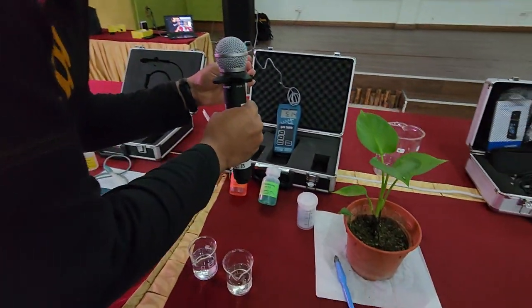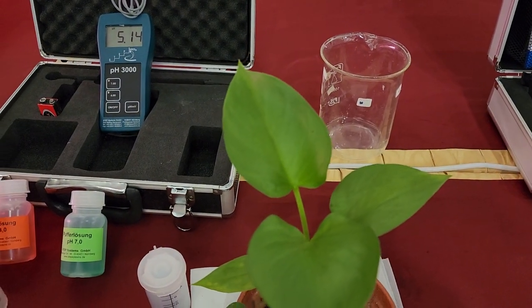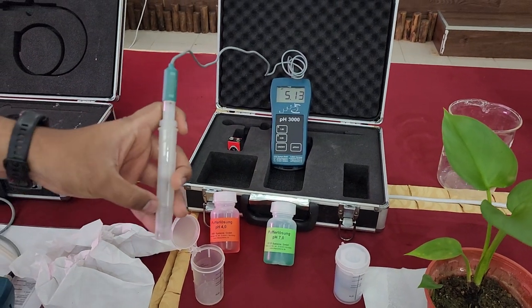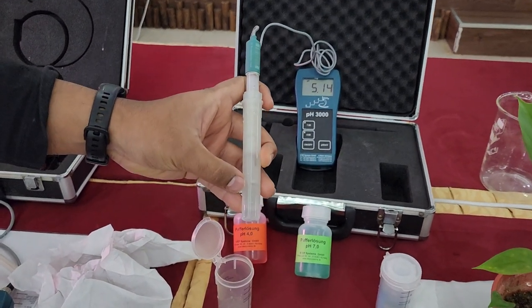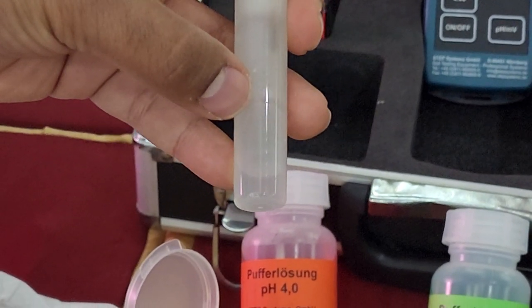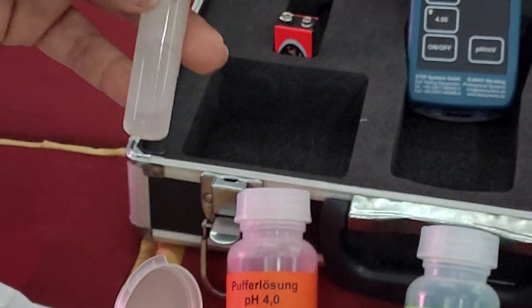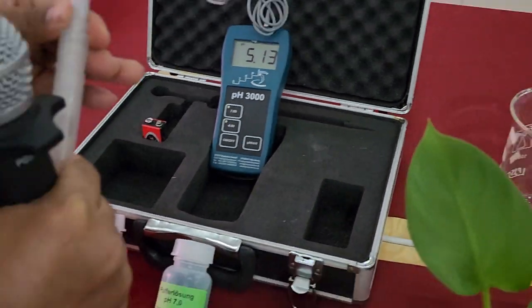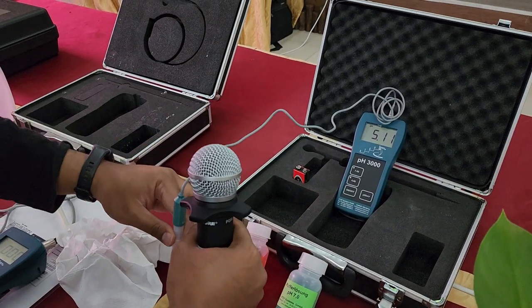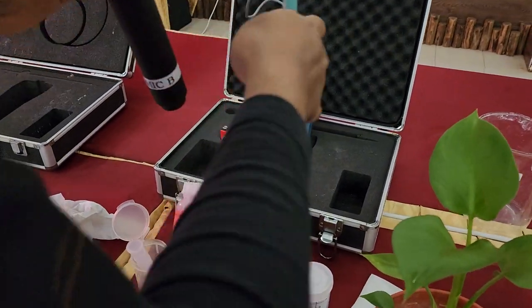Let's open this. I need to be very careful with this. You need a container before we spill the... So this probe is actually in a solution, if you can look closer. Potassium chloride solution. Never store the probe in distilled water. You need... because it's a sensitive piece of equipment. Okay, open that. Put it here. Okay, moment of truth.